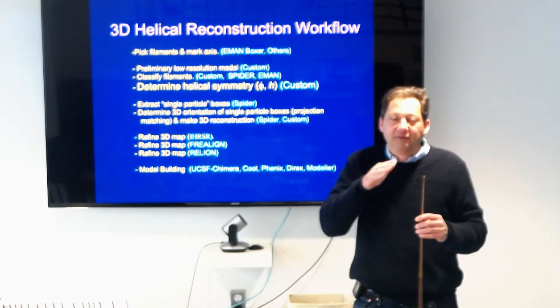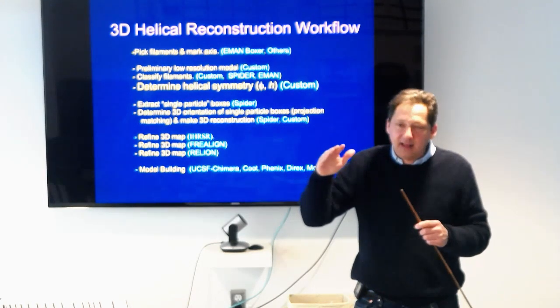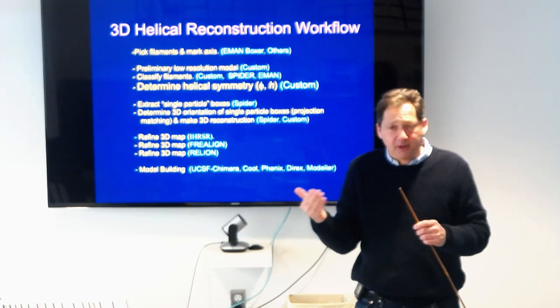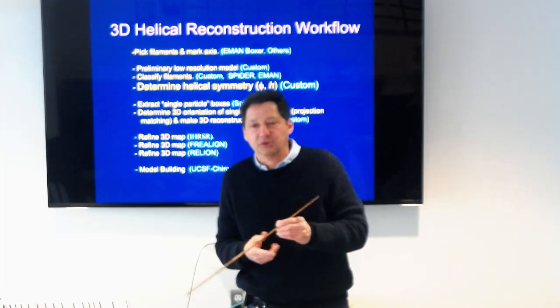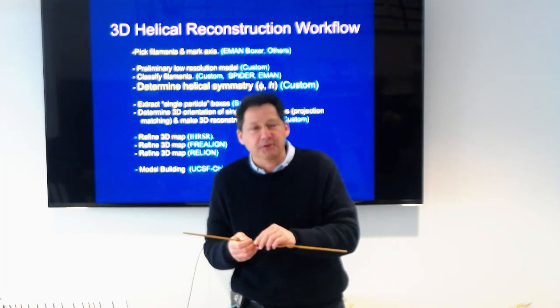But if you don't see secondary structure and it's not getting better as the refinement goes, probably you have the wrong symmetry.